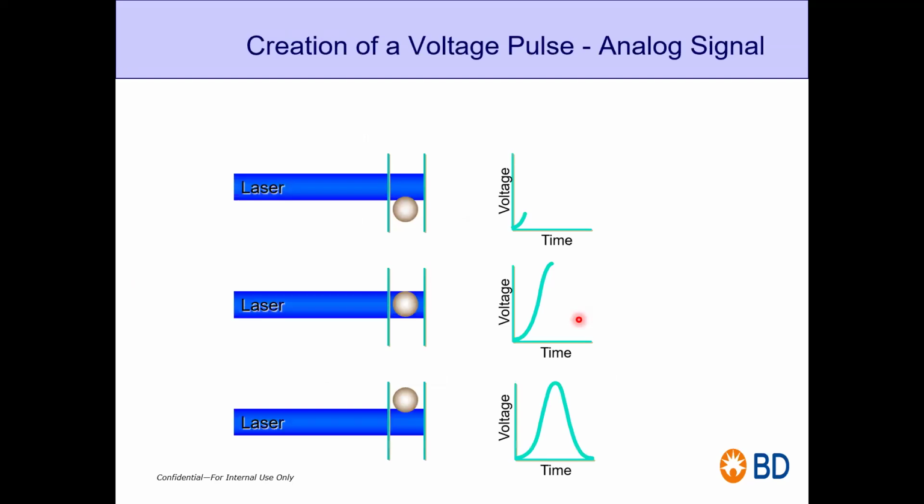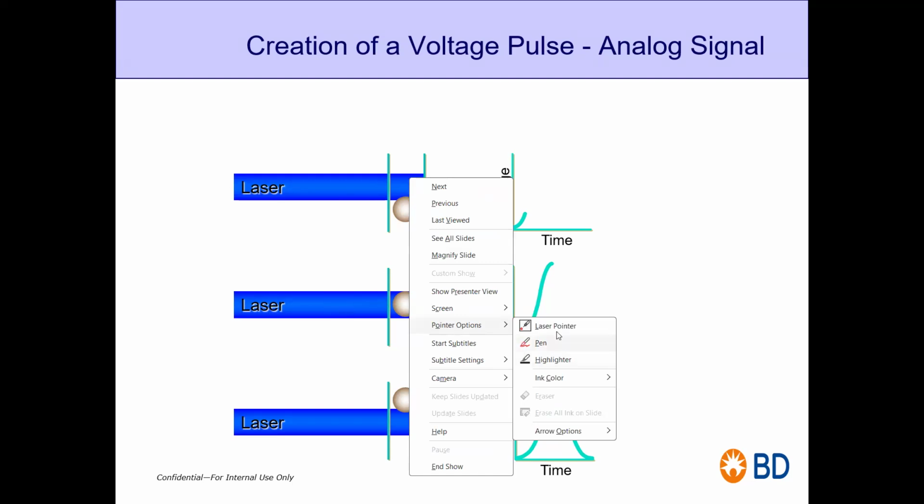Now, what's happening? You see the data there, right? You see data on your PC, but how is the data generated, what is going on inside the computer, inside the machine? We are seeing those graphs, but how are they making this graph, how are things happening? So this is the answer for that. Let me give you one example. First, when the cell comes, this is your interrogation point, a laser. Let me draw it for you here.